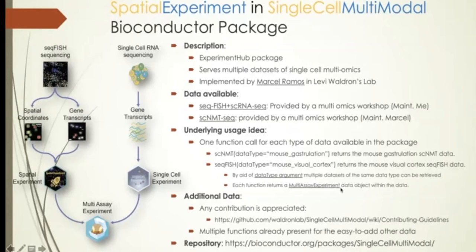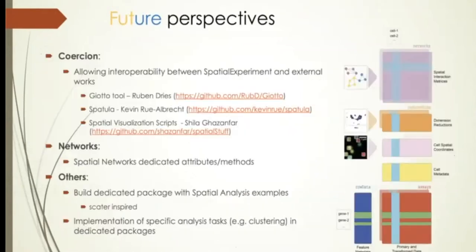multi-assay experiment. Indeed, as shown in the figure, the seqFISH data are stored in the spatial experiment, while the single-cell RNA-seq data are in the single-cell experiment, and we combine them into a multi-assay experiment object.